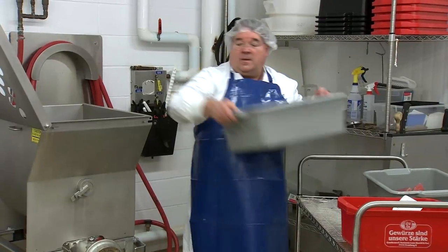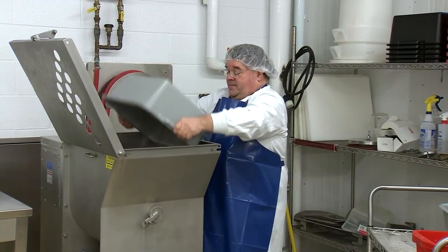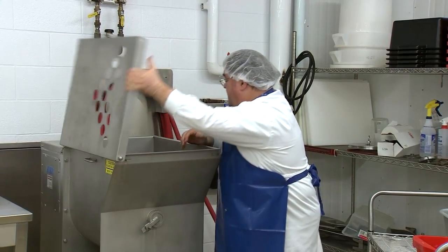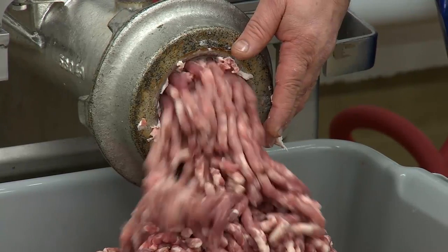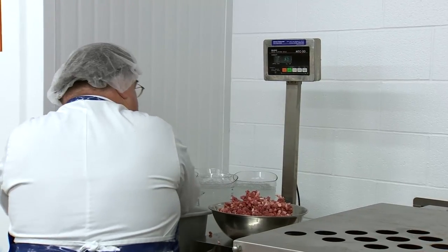Hot dog production is all about particle size reduction and protein extraction. The first step of that particle size reduction is grinding of the meat. The initial grind is coarse.